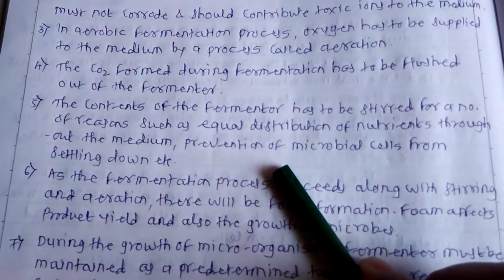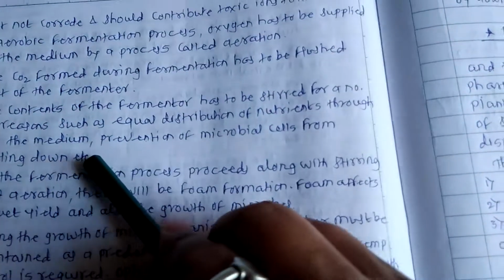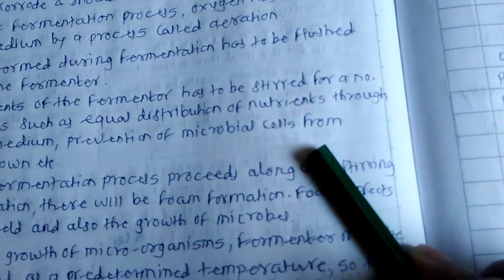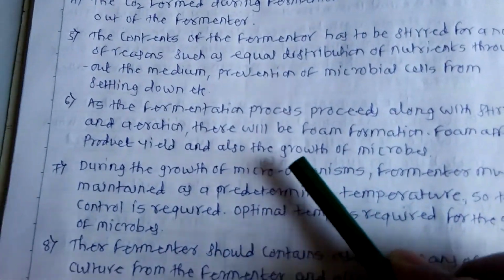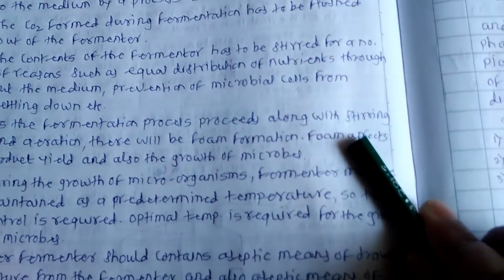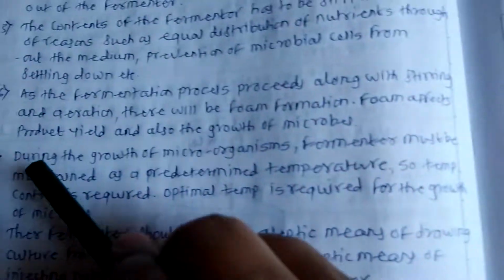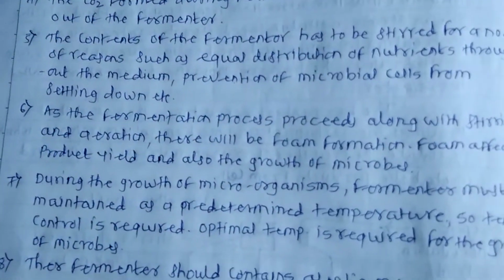Because of the stirring, there is equal distribution of nutrients throughout the medium, and each and every bacterium takes nutrients and grows in the fermenter. Next, foam is formed as the fermentation process proceeds, during stirring and aeration. This foam affects the product yield and the growth of microbes. That's why the fermenter must control foam formation.